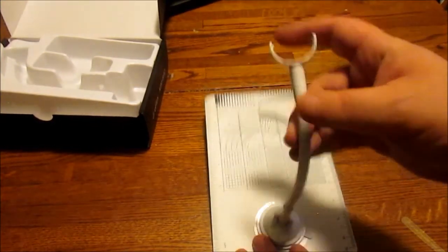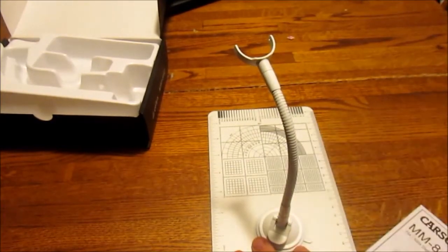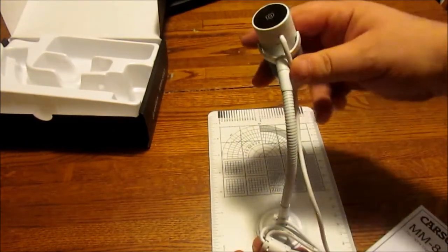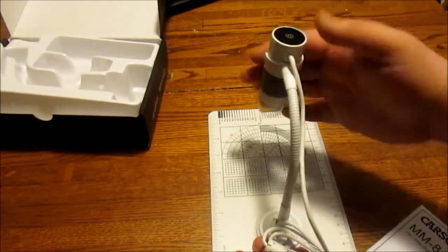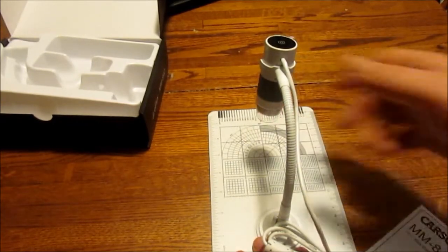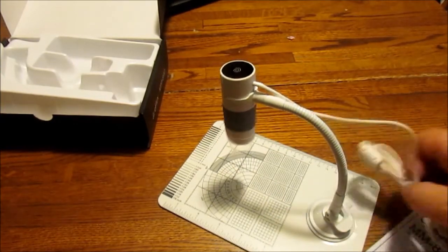There are a couple of dimples on the arm where the camera fits in, and you can see the matching dimples on the camera — just clip it on there. Pretty simple. I could see the tabs on this breaking if you weren't careful with them though. The camera is much smaller than I thought it was going to be. The cord's not very long either, which is a bit of a pain.